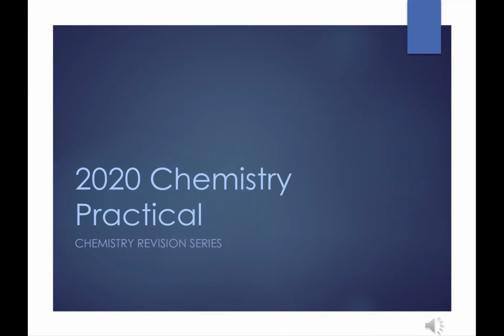I'm now going to go through the 2020 chemistry practical. So you can refer to your marked assignment. And I think as we go along, do look through the various things to take note of.